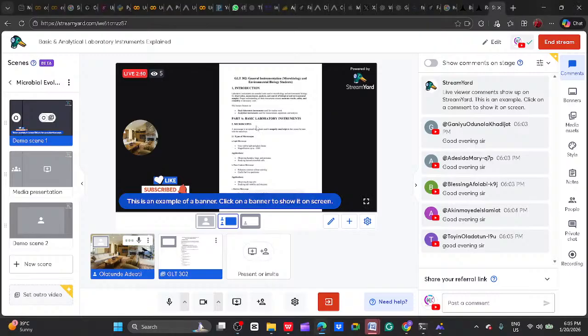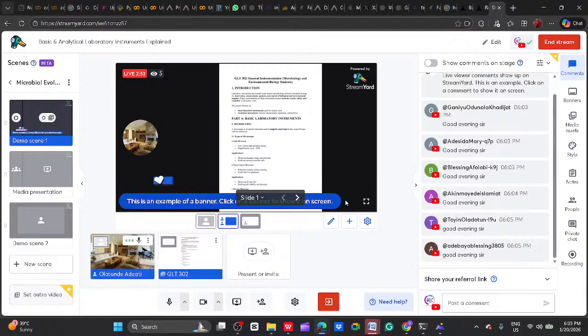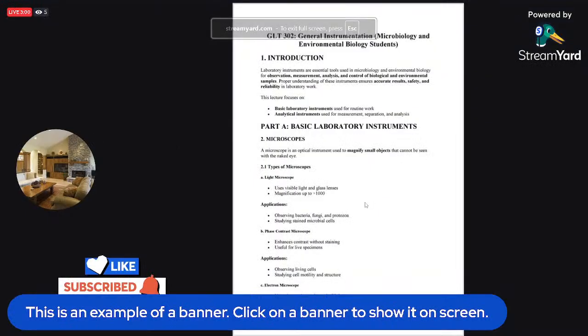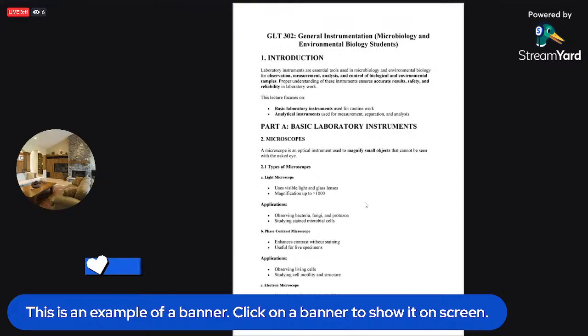So without wasting our time, I am going to go straight to the topic of today, and that is general instrumentation, which is actually meant for microbiology and environmental students.